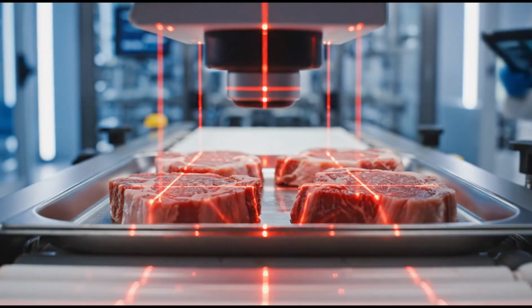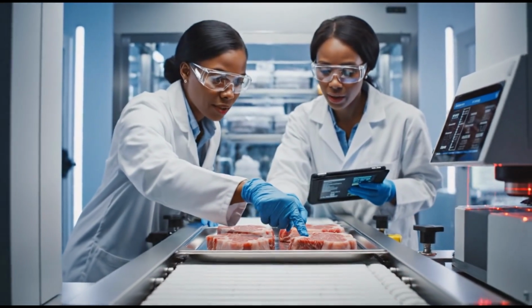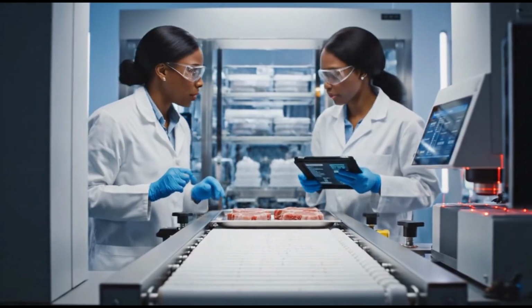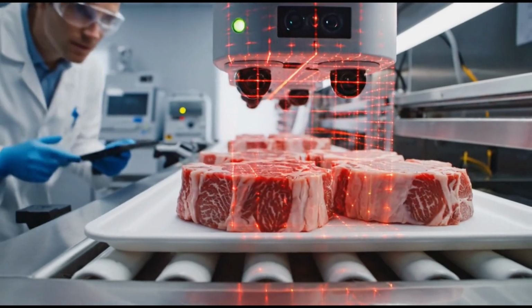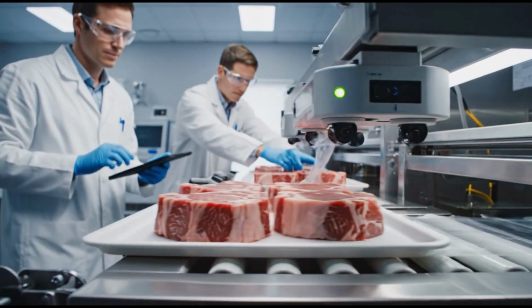Structure confirmed. The texture profile matches the target aesthetic. The sensors verify the dimensions. We can move them forward. Dimensions confirmed. Structure is flawless. Excellent. Sending to the next stage.